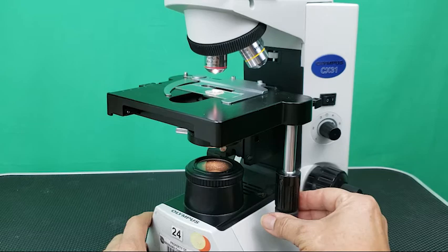Then, using the course adjustment knob, watch the stage as you decrease the distance between the slide and the objective. Continue turning the course adjustment knob until the objective stops.